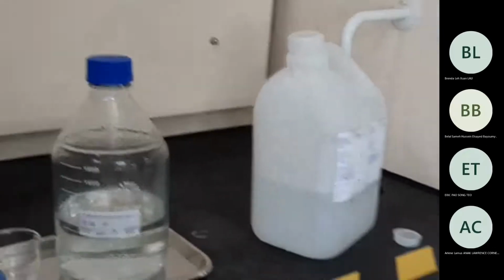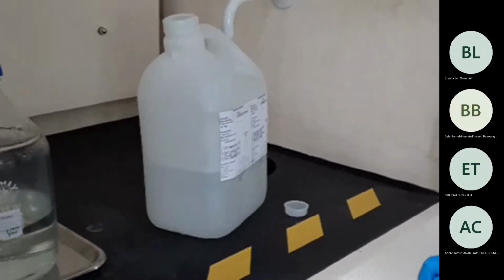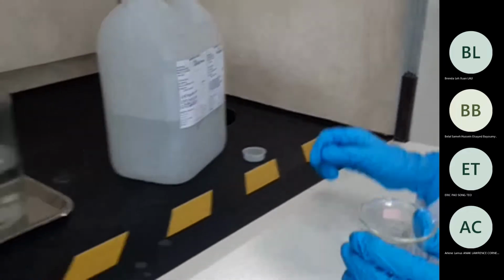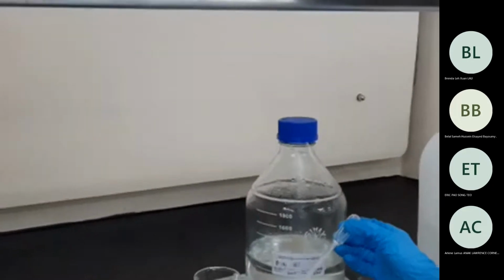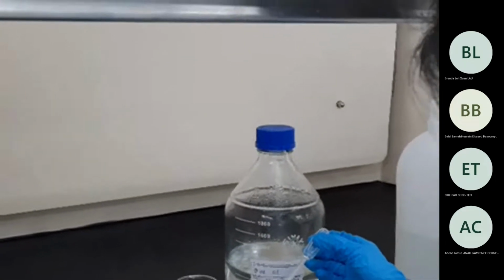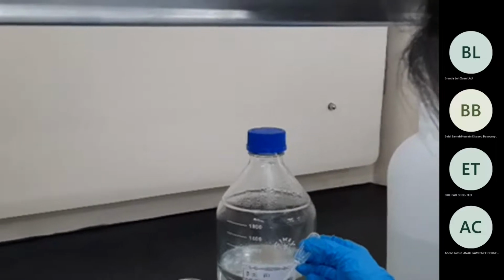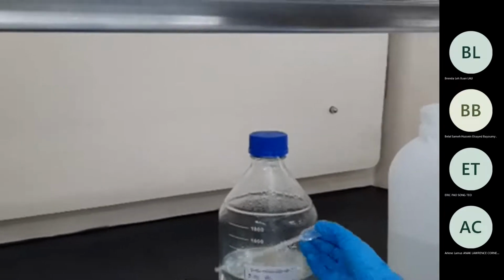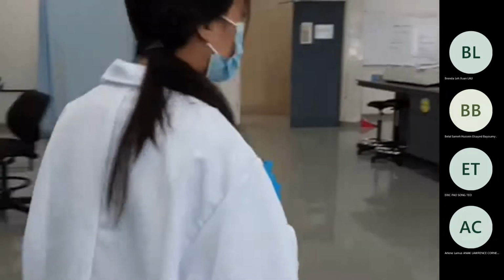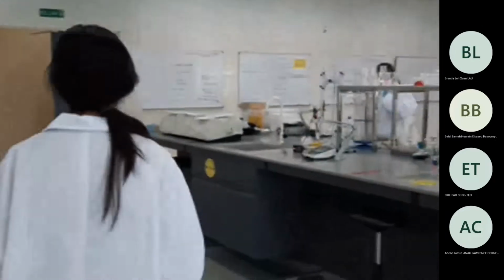Yes, this is the HCl, and use this. I already rinsed it for you, so just take 5 drops from here. 2, 3, 4, 5. Yep. Swirl a bit. Yeah, enough. Good. So now take the pH. Determine the pH there.